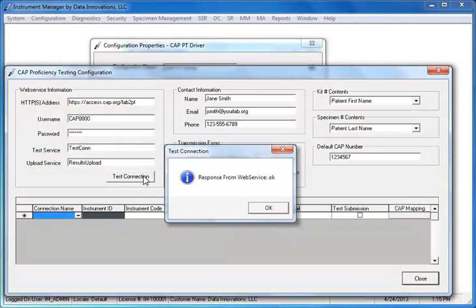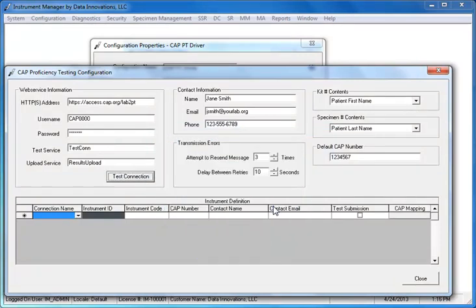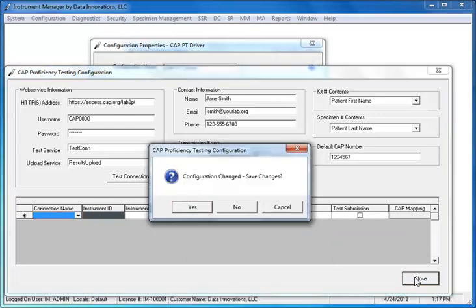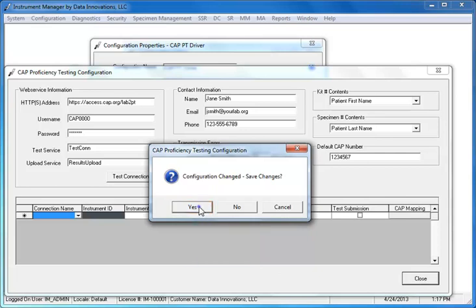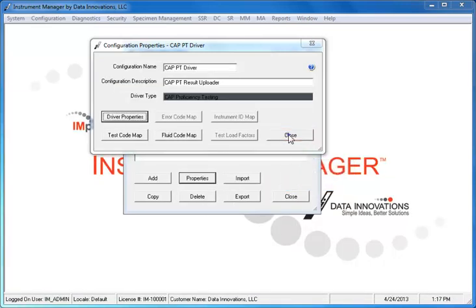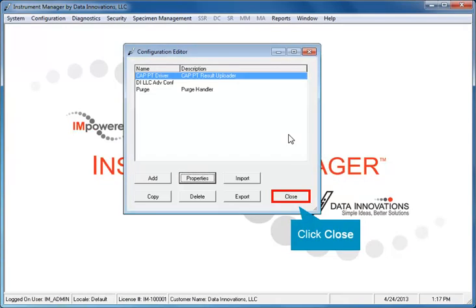In this example, the connection is good, so click OK. Click the Close button to close the Configuration dialog and click Yes to save your changes. Close the Properties dialog and close the Configuration Editor.